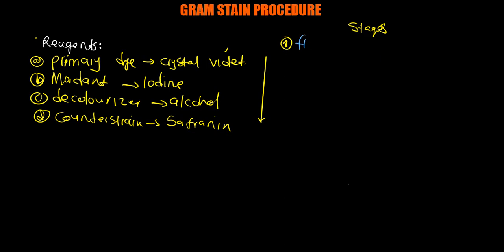So say flood the sample. We're going to flood the sample with crystal violet for just 60 seconds. So you flood the sample that you have with what we call crystal violet.